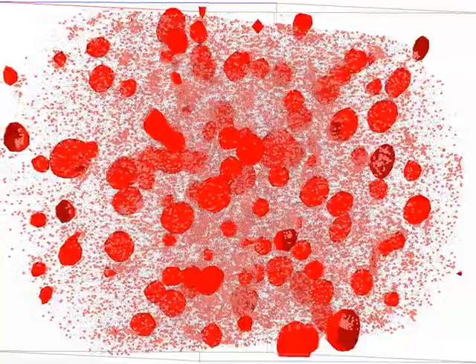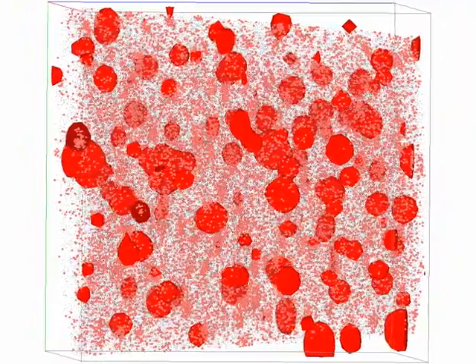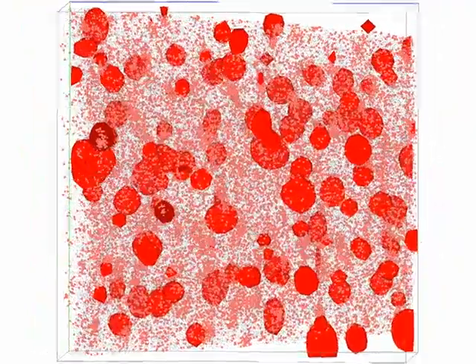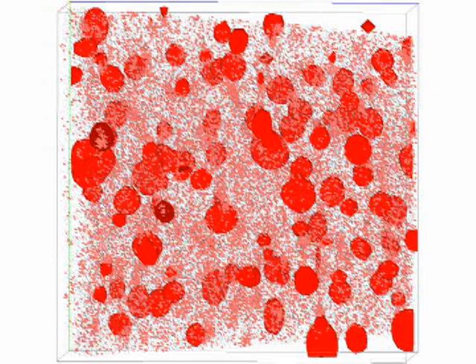The shape of the sample is natural. That's part of the data here on the right side is the data that's taken earlier in the session.